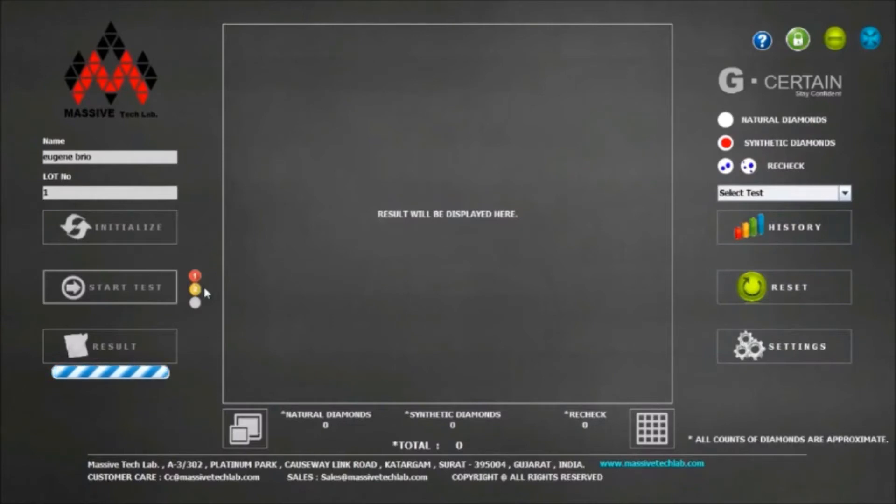Once test will be completed, result button will be enabled. You can click on help button in upper right corner in case of any help of software operation. After few seconds of processing, result button turns into a label.